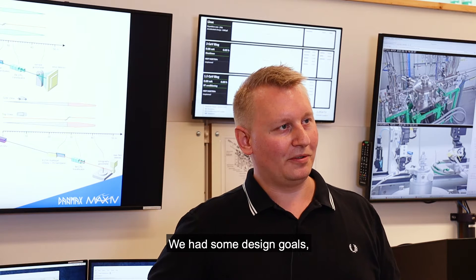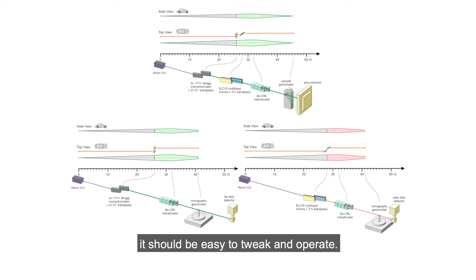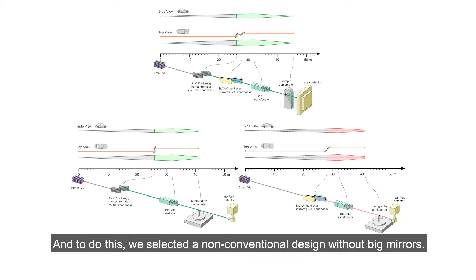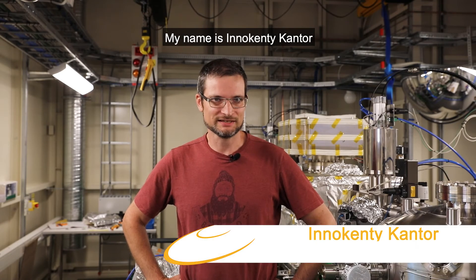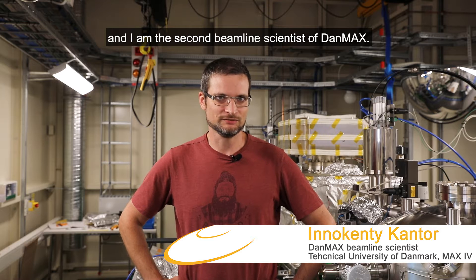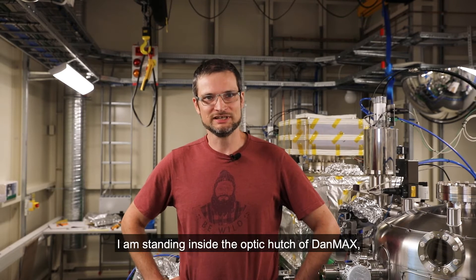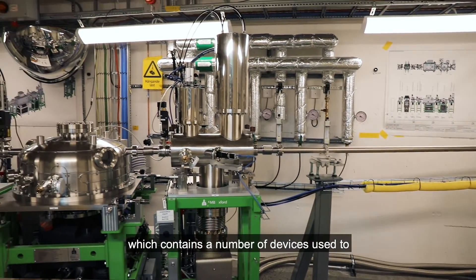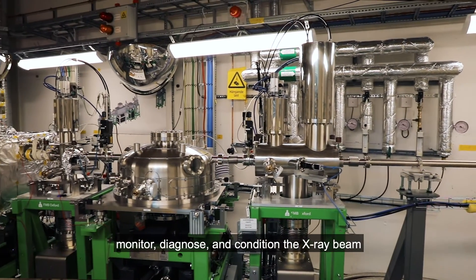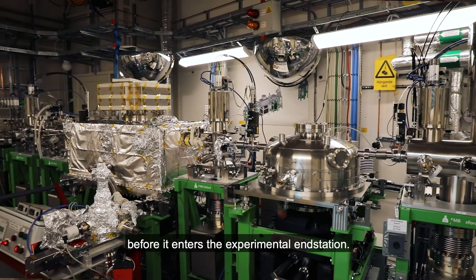We had some design goals: we would like to have a very stable beam, it should be easy to tweak and operate, and to do this we selected a non-conventional design without big mirrors. My name is Anakenty Kanter and I am the second beamline scientist of DanMAX. I am responsible for the imaging part of our activities. I am standing inside the optics hatch of DanMAX, which contains a number of devices used to monitor, diagnose, and condition the X-ray beam before it enters into the experimental end station.